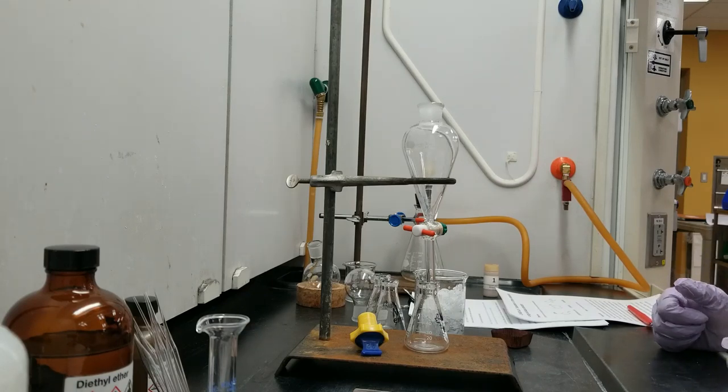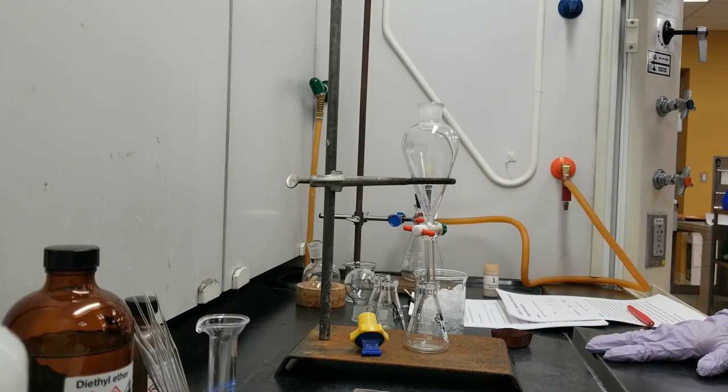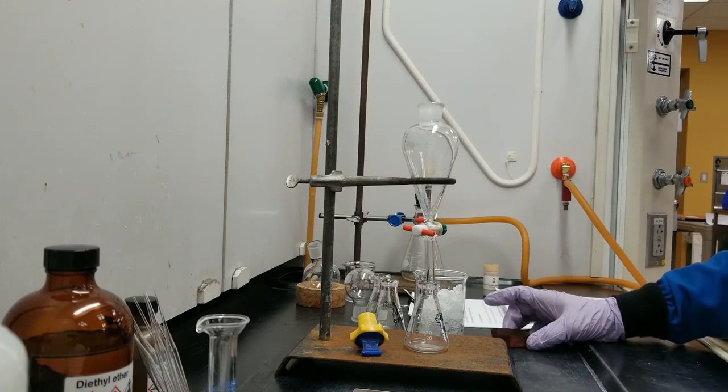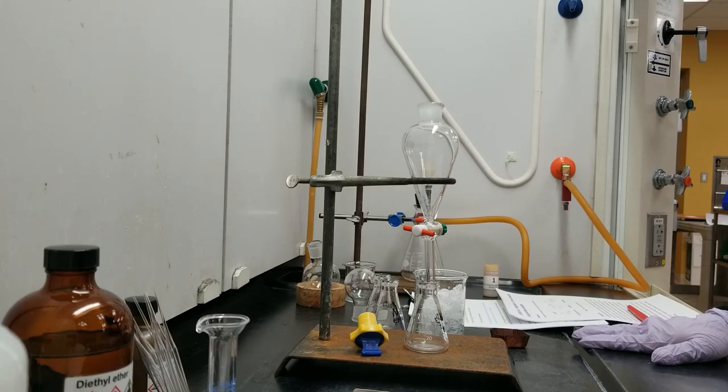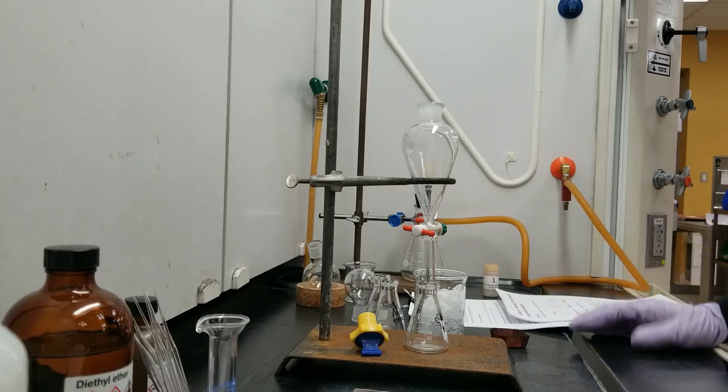So hello everyone, I will be doing the lab for you folks. The lab is for CH338, organic chemistry. The title of the lab is separation of three compounds using acid-base extraction. The idea of the lab is we have a mixture of three different solid components. One is acidic, one is basic, and the other one is neutral. So we'll be using the liquid-liquid extraction method to separate this mixture into its own compositions.